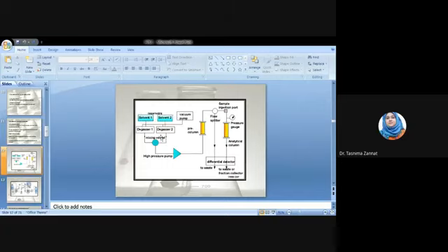Here degasser 1 and degasser 2 can control the flow of the solvent, and this is the mixing vessel. After selecting the ratio of the solvents, something like solvent 1 and solvent 2, it may be taken as 50-50, or it may be taken as 30-70, like this. So whichever you select in the software, it will take like this.